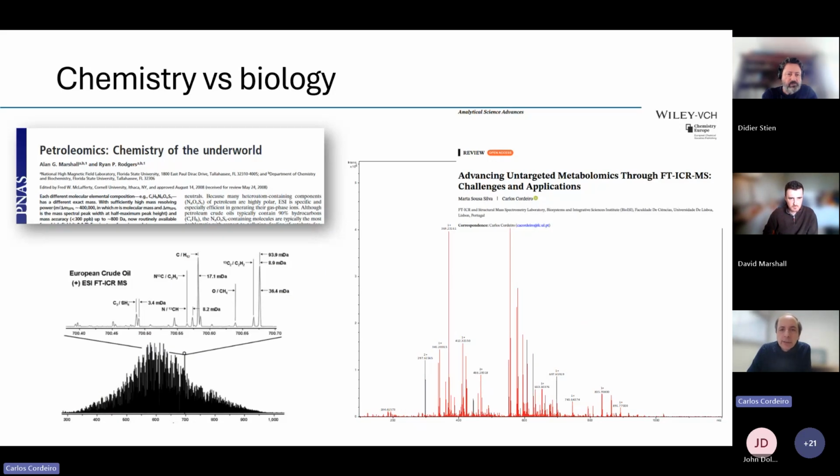On the other hand, if you're dealing, say, with samples that are extracted from something that was alive, at least before the extraction, so a metabolomic sample, what you actually have is a different picture. You have more sparse regions of very high density with regions of low density and a very pronounced effect of the dynamic range.